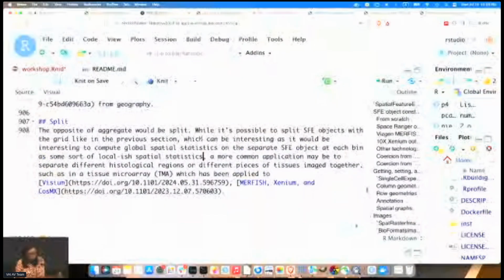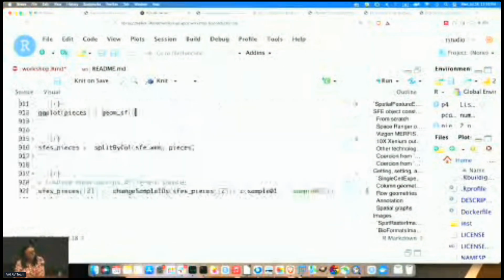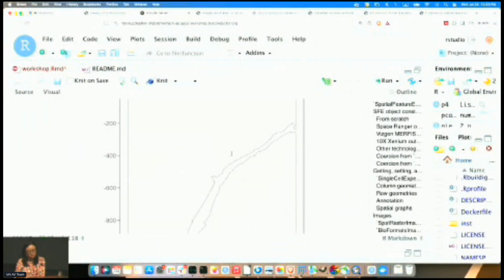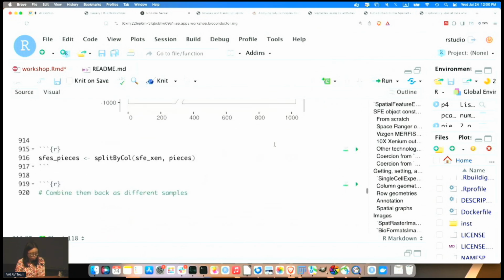So the last one is split, which is the opposite of aggregate. The special part is that you can use a geometry to split a spatial feature experiment object. Say I use these polygons: the cells in this piece will become one SFE object, and cells in the other piece will be a separate SFE object.